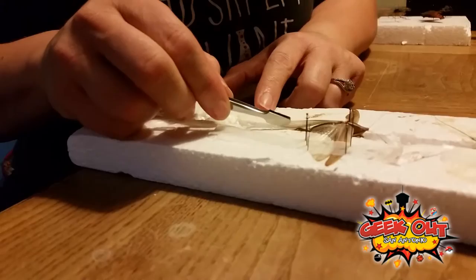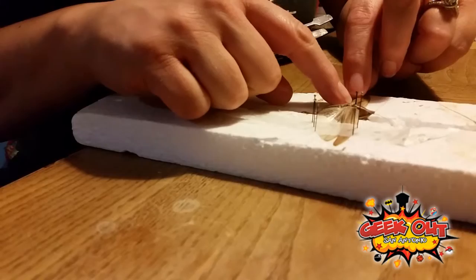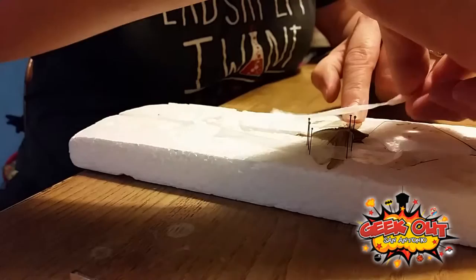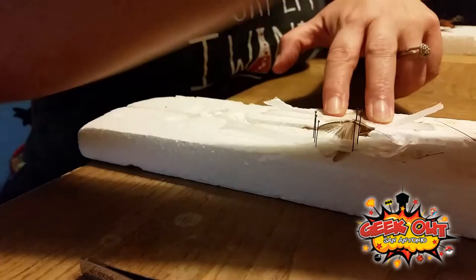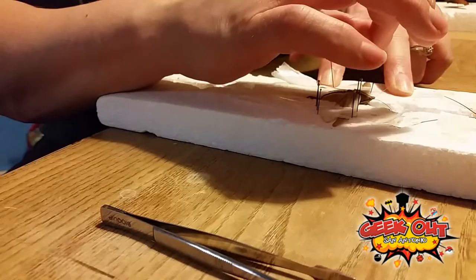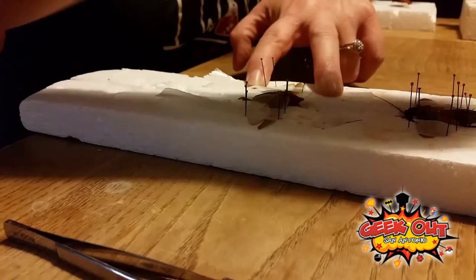After you're done pinning the wings, you can pin the back legs. A lot of people like for them to look like they're jumping or flying around. You can pin those however you'd like. I wasn't afraid of the katydid like I was of the cockroach, so the pinning was much easier for me. Their wings are just really, really pretty — they're very beautiful.